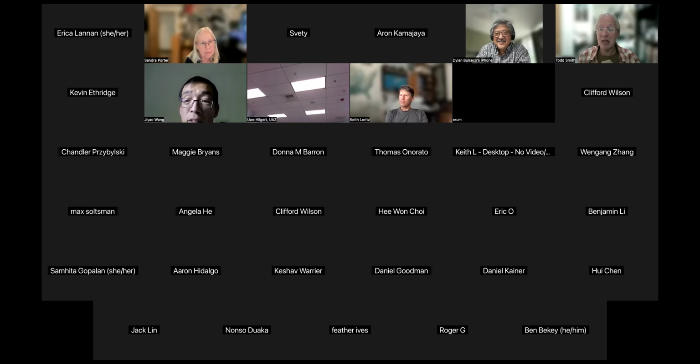It could be A and B in another structure. So I'm asking these questions for Dylan. You're exactly right. And it sounds like Node.js is the way to go and not Python. There seems to be way more flexibility with Node.js. Exactly, what Jiao's showing is there are a lot of Node.js scripts that have been written.